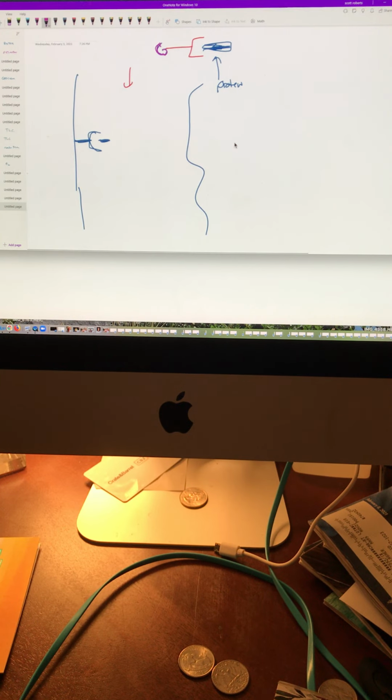Got it? So now what happens is, as you run it through, we capture the protein and we capture the antibody. Oops, my colors are off here. So we capture the protein and we capture the fluorescence. If it went through, now we zap the laser. And when we zap the laser, it lights up green, red, whatever kind of color we made it. So it's an antibody to the antibody complex. And if you bound the antibody complex, it goes.